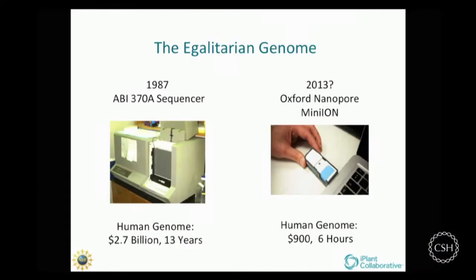But if we had an egalitarian gene made possible by a gel electrophoresis chamber, now we have what you might call an egalitarian genome, which has been made possible by new methods for so-called next generation sequencing. As you may know, to sequence the original human genome cost about $3 billion, and it took 13 years.